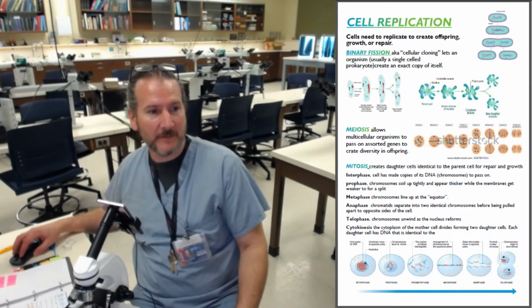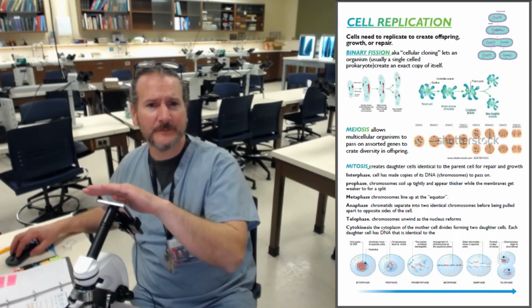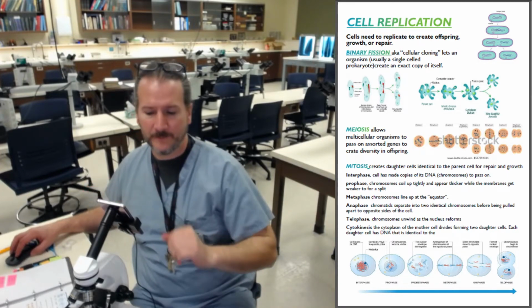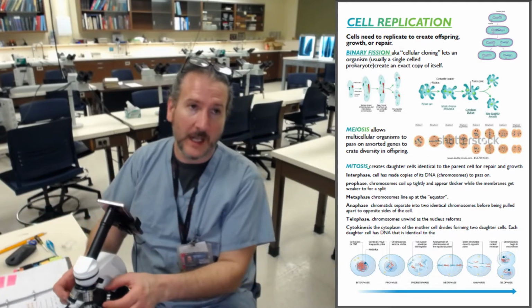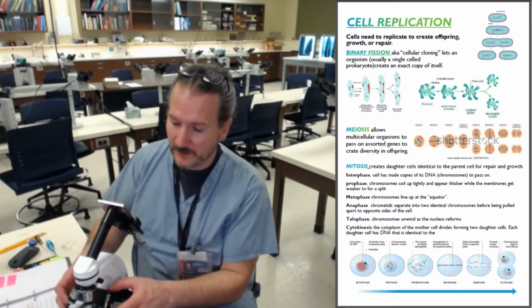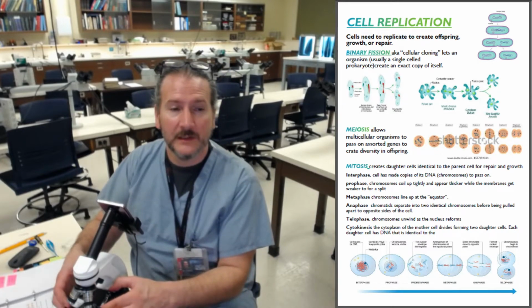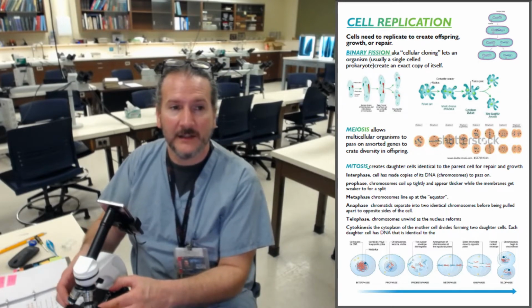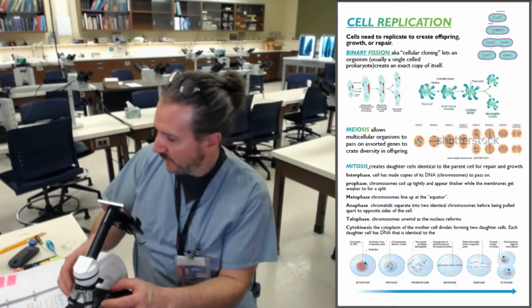Let me turn on my microscope. Camera. Oop, flip it over. Right, I have my stage in the low position. I'm going to bring my stage clips back. Right here, stage clips. I'm going to slide down into the middle.